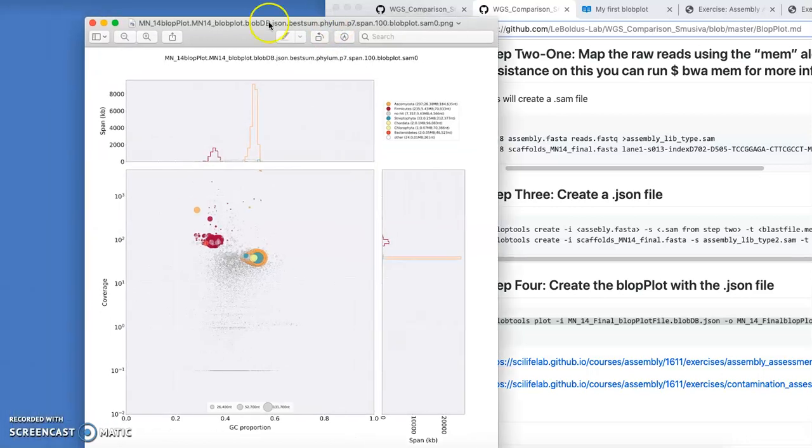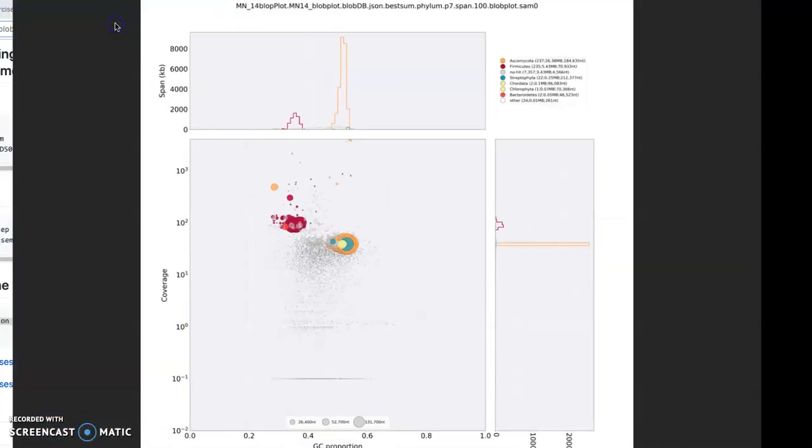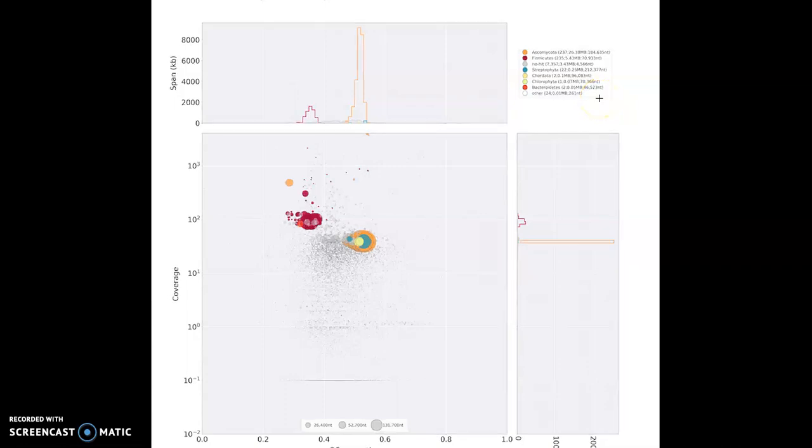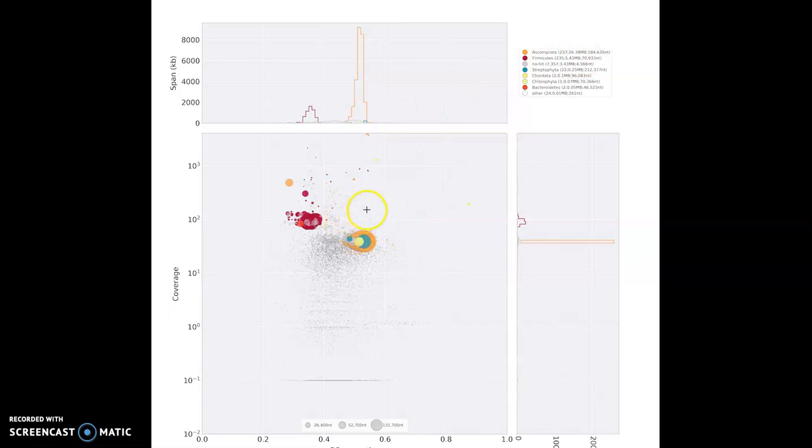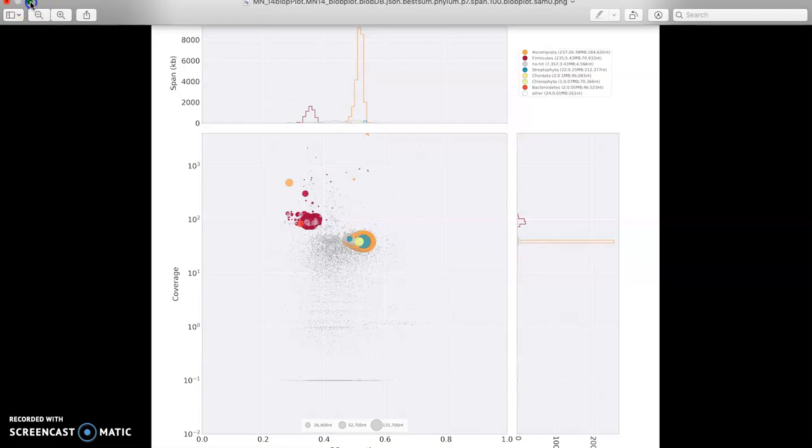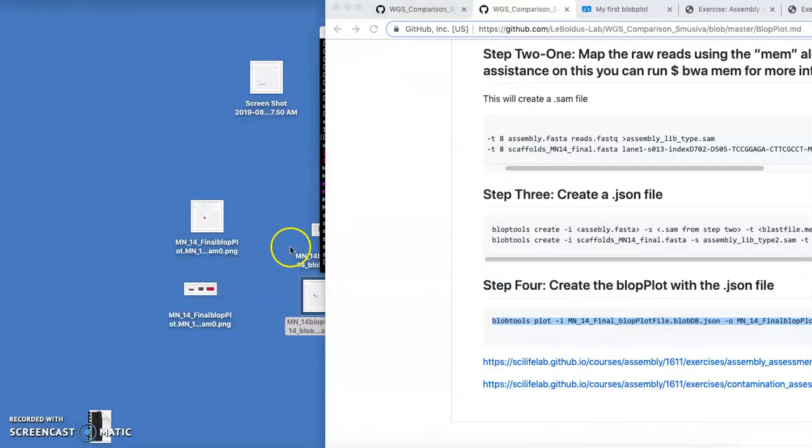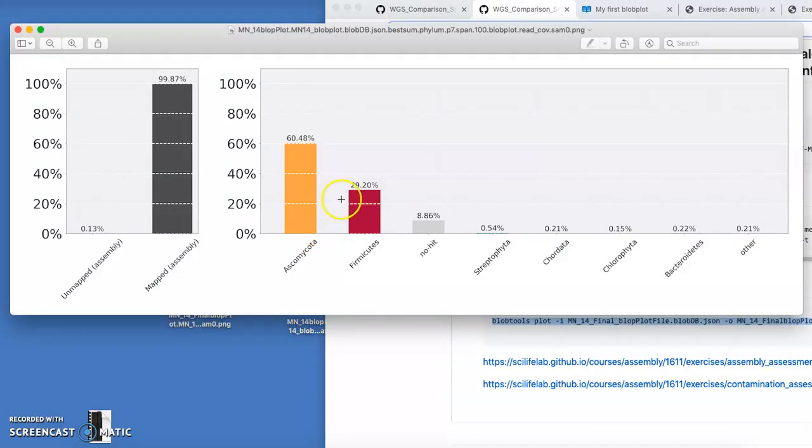It creates a blob plot showing us, we did this actually for the MN14 isolate, because it appeared to have some contaminations in it. And our blob plot shows us what those contaminants are. And so then we can take the next step into cleaning it up.